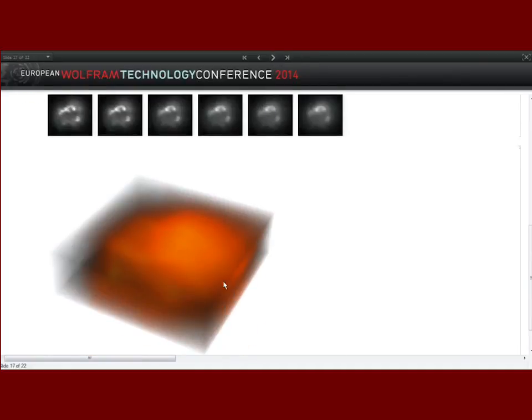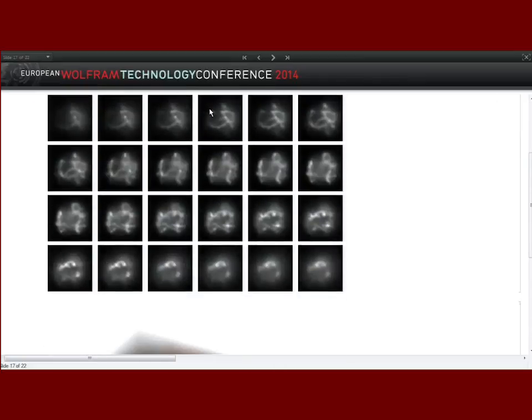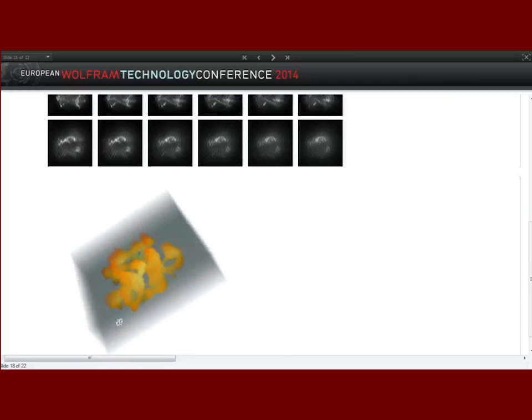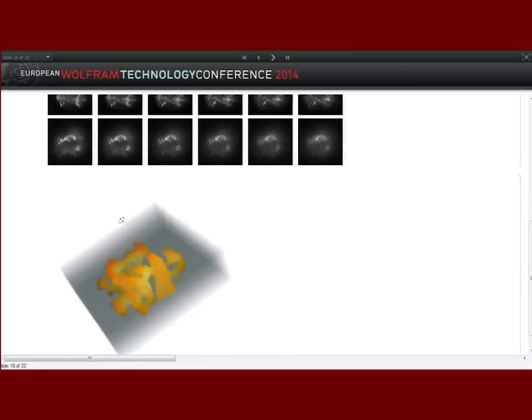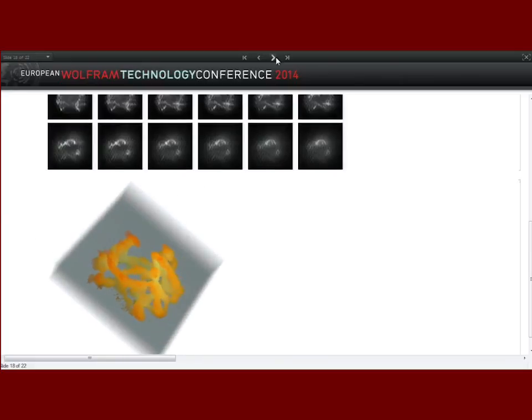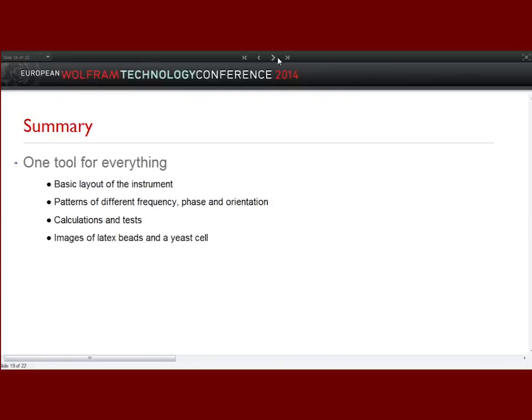Okay, and let me just conclude. Well, this is the original information without an improved resolution, and this is the processed data, and now in this case we're looking at mitochondria in yeast. We can really see the mitochondria. The resolution improvement is somewhere between 2.6 and 4, depending on the resolution, which is very dramatic, because you have to take this to the power of 3 in 3 dimensions.